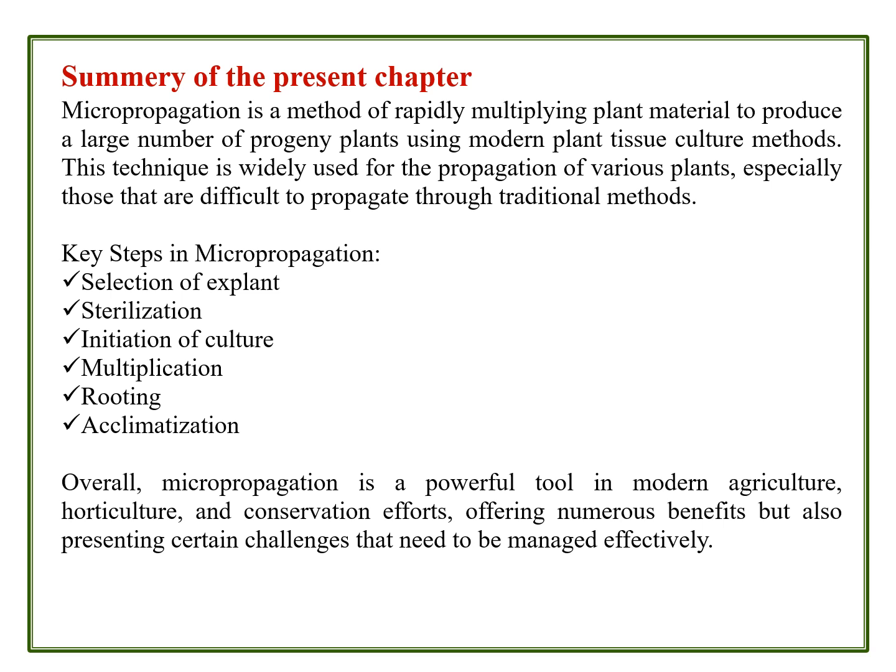Initially an unorganized group of cells will be raised, which is known as callus, followed by multiplication, where the hormonal concentration, that is the auxin to cytokinin ratio, will be varied. Here the cytokinin ratio is increased to get multiple shoots, that is multiplication. Then the rooting process: here the hormonal combination, the auxin to cytokinin ratio, will be reversed. A lower concentration of cytokinins and a high concentration of auxins will be used for obtaining the rooting, and acclimatizing to the laboratory conditions.